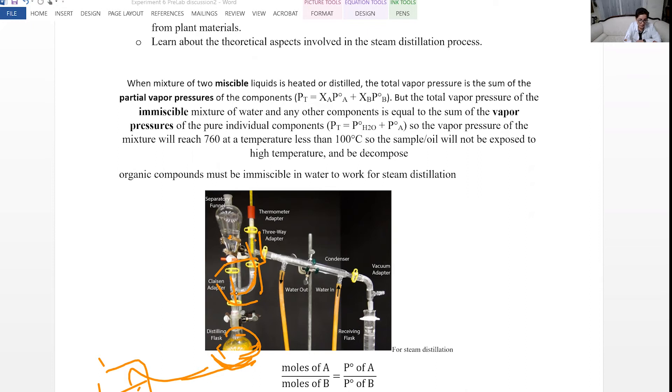Why do we need this curve here? Natural products, when you heat them up in water, they foam and you don't want that foam to make its way to the condenser. So this curve is preventing that foam from making it to the condenser. It's kind of a safety.